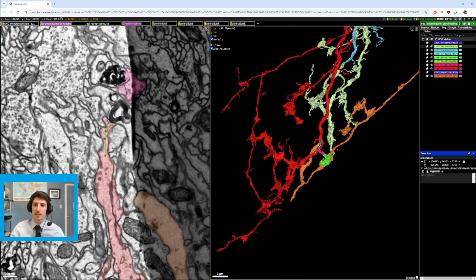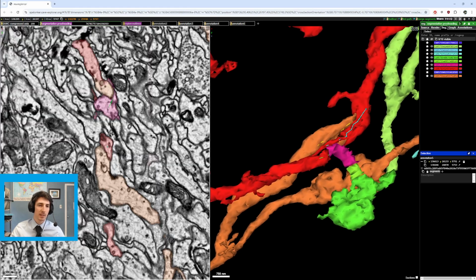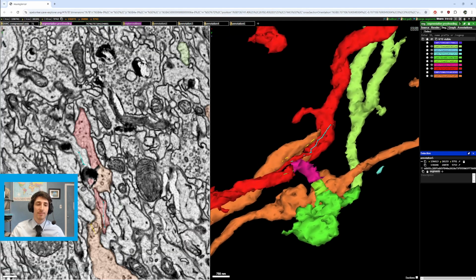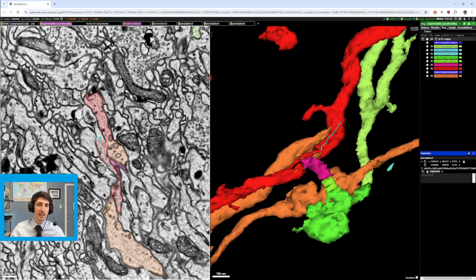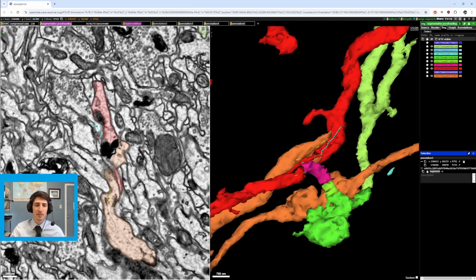So let's get into it. Let's see what's going on here, and let's see where these point paths lead. This type of finding the paths can be difficult. So what you're going to want to do, as in the previous video, is start further away from the accident area, and just go slice by slice.